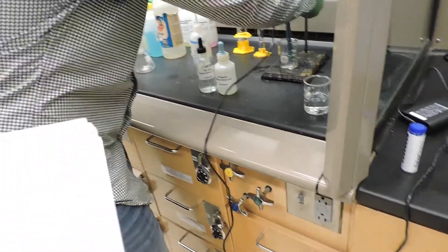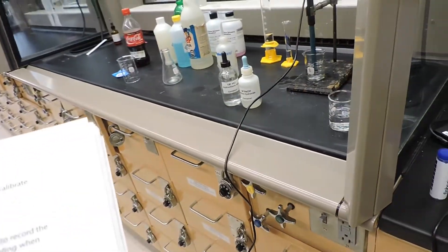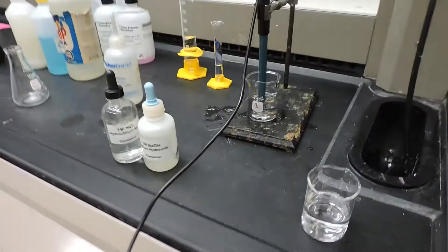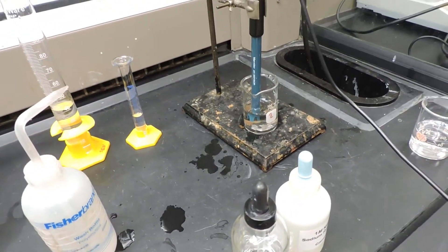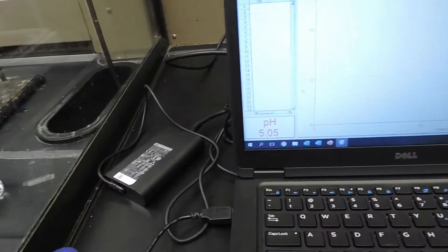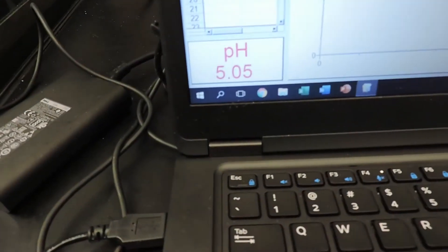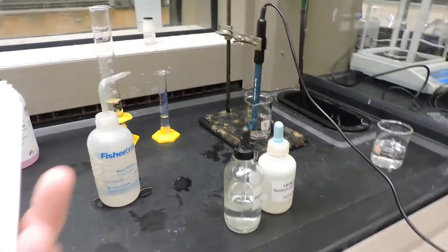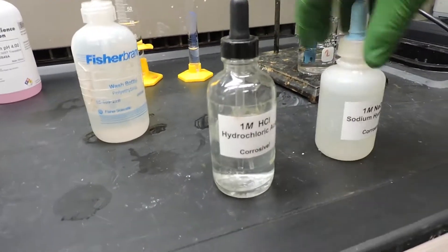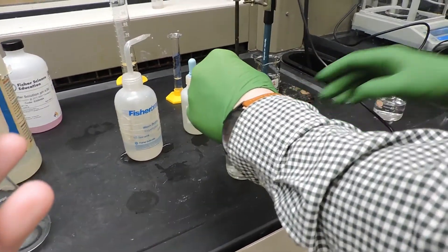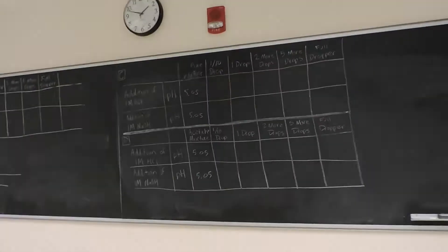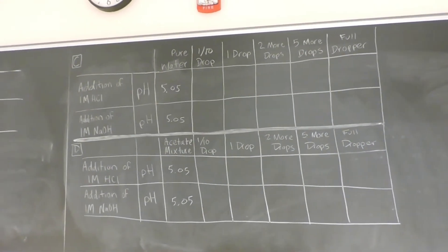Now we're on to part C of the experiment, which is the effect of acid or base on the pH of water. So we have 50 milliliters of water, DI water, in a beaker. We've immersed our electrode, and we'll record the initial reading of pH, which is 5.05. Next we're going to use dropper bottles of hydrochloric acid to expel a certain amount of the drops into the solution and record pH. According to our table, we need one tenth of a drop, one drop, two drops, five drops, and the full dropper. So we're going to go in that order.